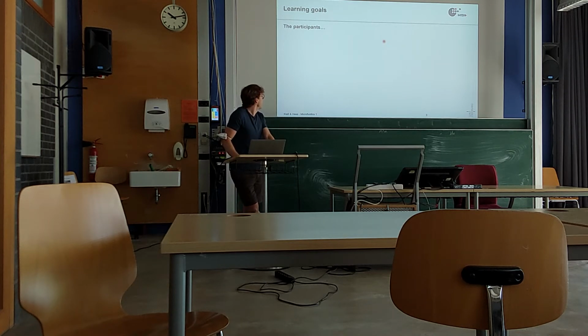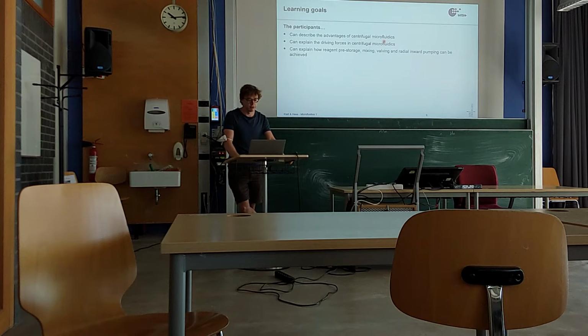So after this lecture, you should be able to describe the pros and cons of centrifugal microfluidics. You should be able to understand the driving forces, so all the forces that are relevant in centrifugal microfluidics. And finally, you should also be able to understand some of the basic unit operations that are regularly applied in centrifugal microfluidics.